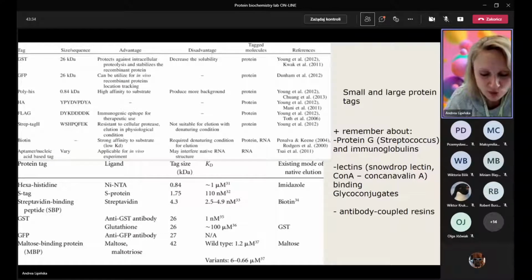Now, when we are using N-terminal fusions, so the tag comes first, then the start codon is in front of the tag, and after that, we avoid using start codons because bacteria are more specific. They have this Shine-Dalgarno-based system, at least the canonical one. But mammalian cells are more tricky. Generally, we have the scanning mechanism of translation.